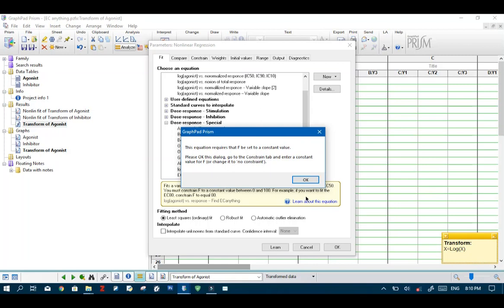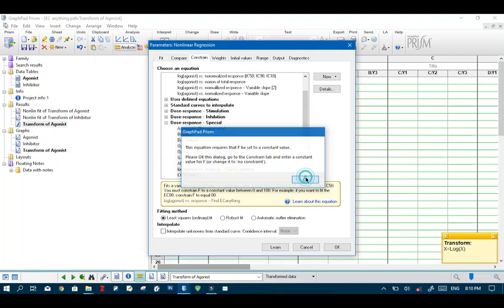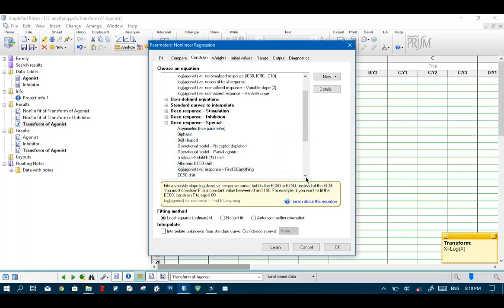Now immediately GraphPad Prism will pop up a dialog box which says we need to enter an F constant value. Just hit OK.